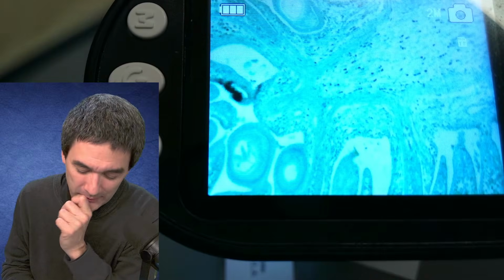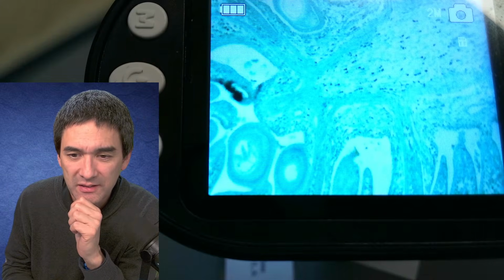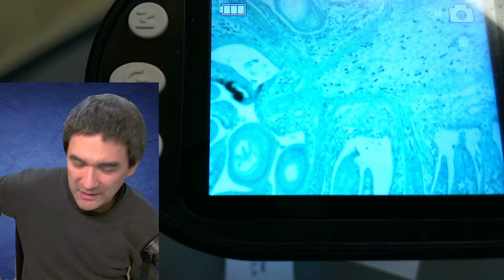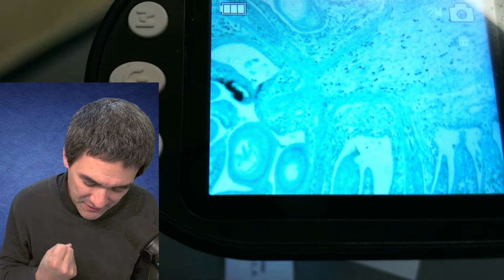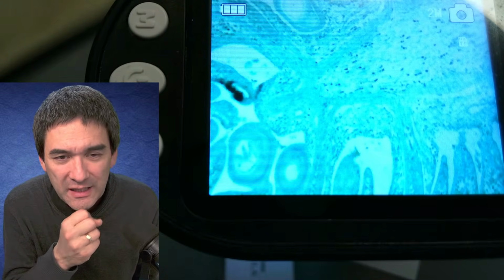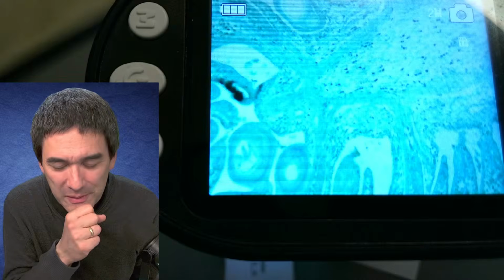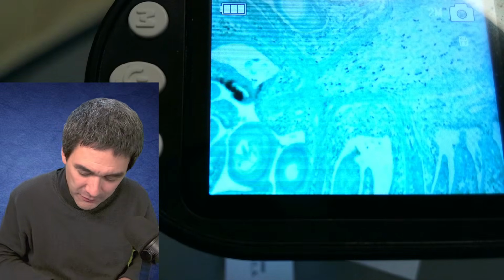I'm not giving up hope entirely that maybe they're going to release a product that's got all of these aspects fixed. To a certain extent it's a bit of a disappointment. You see, it does work, right? But if I get the feeling that the people who designed it were lazy, and I think that is indeed the correct term, then this bothers me a little bit. These tiny issues have to be fixed in my view.